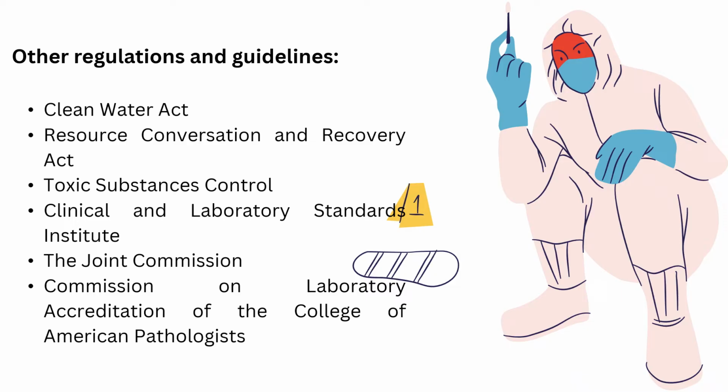Safety is also an important part of the requirements for initial and continued accreditation of healthcare institutions and laboratories by voluntary accrediting bodies such as the Joint Commission, formerly known as the Joint Commission on Accreditation of Healthcare Organizations. And there's also the Commission on Laboratory Accreditation of the College of American Pathologists.